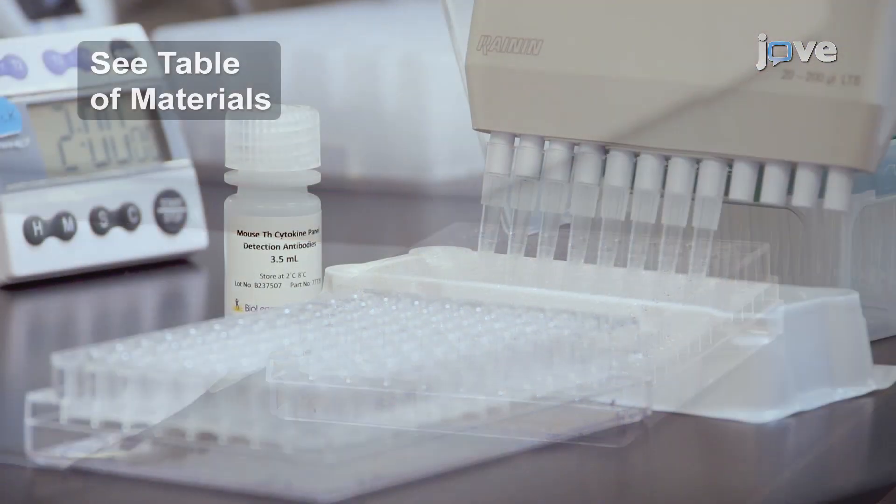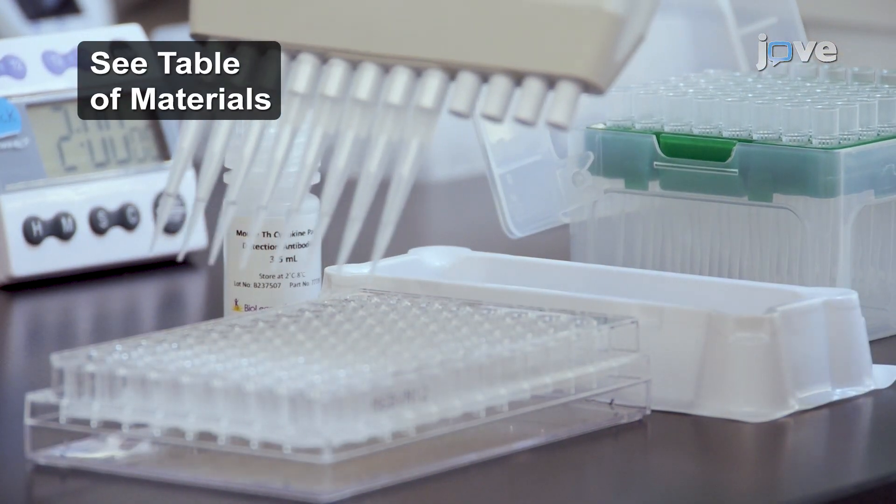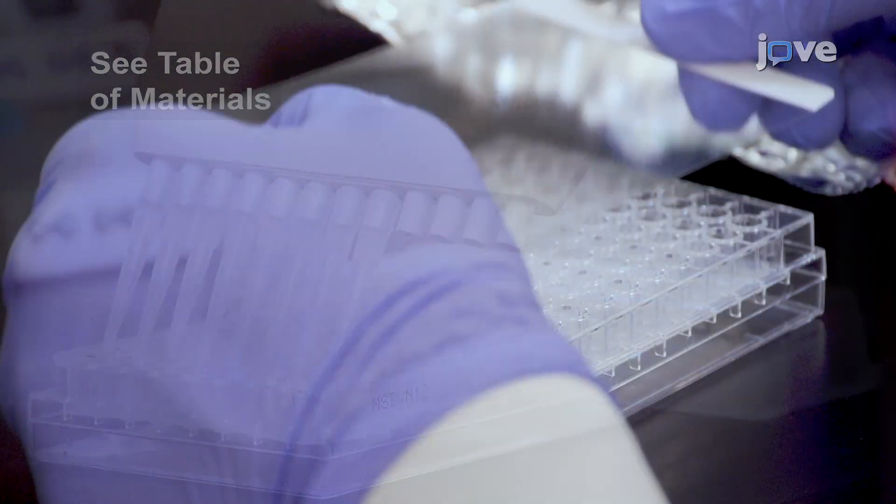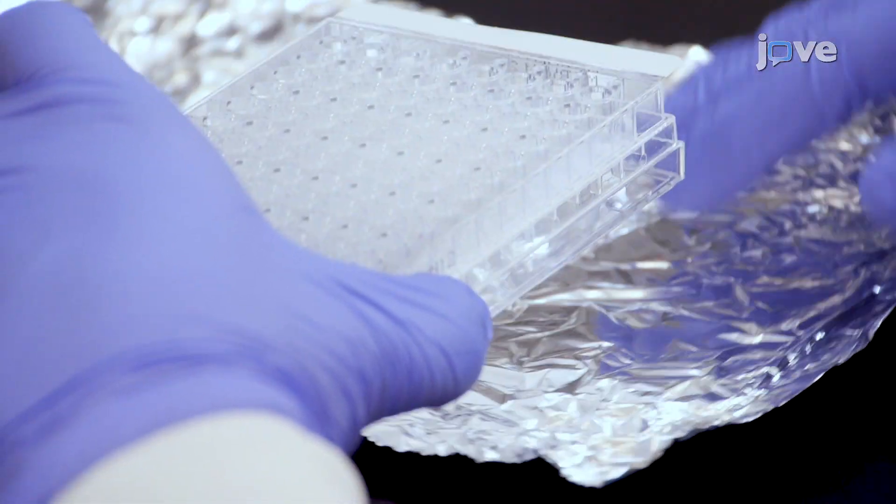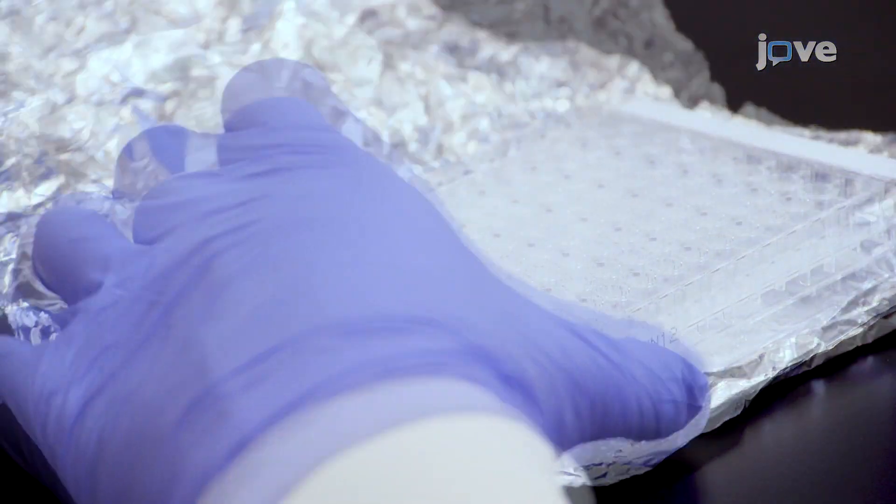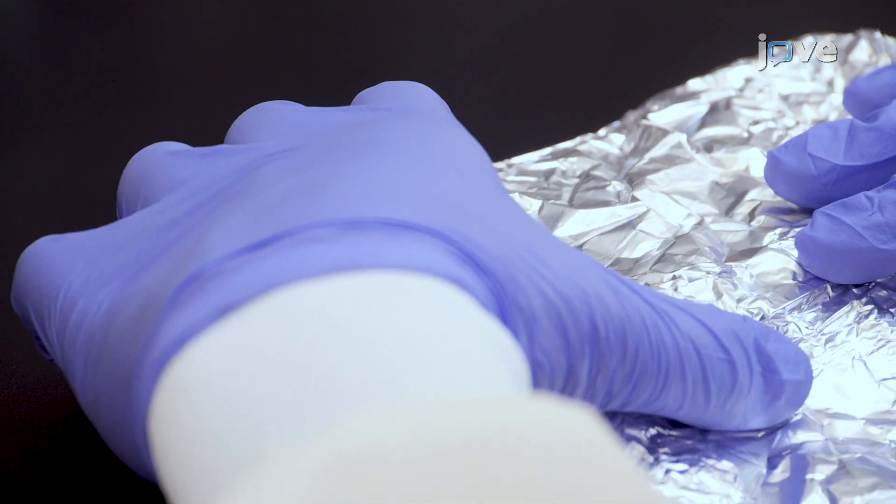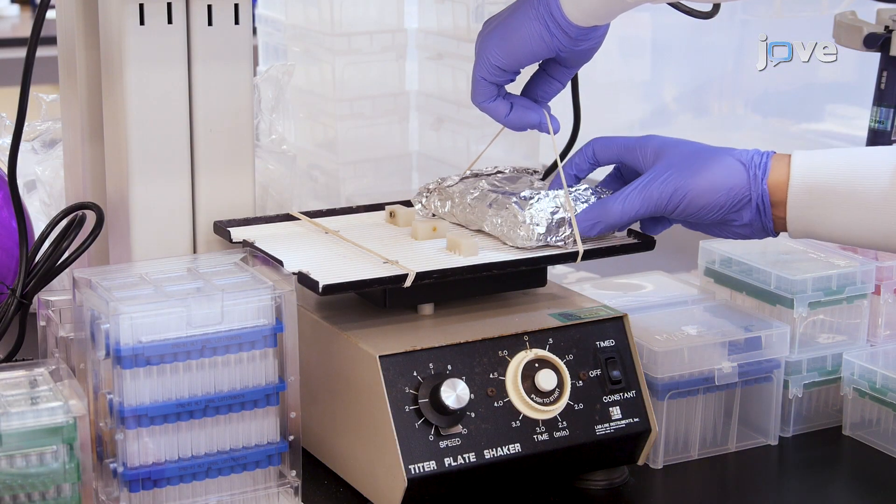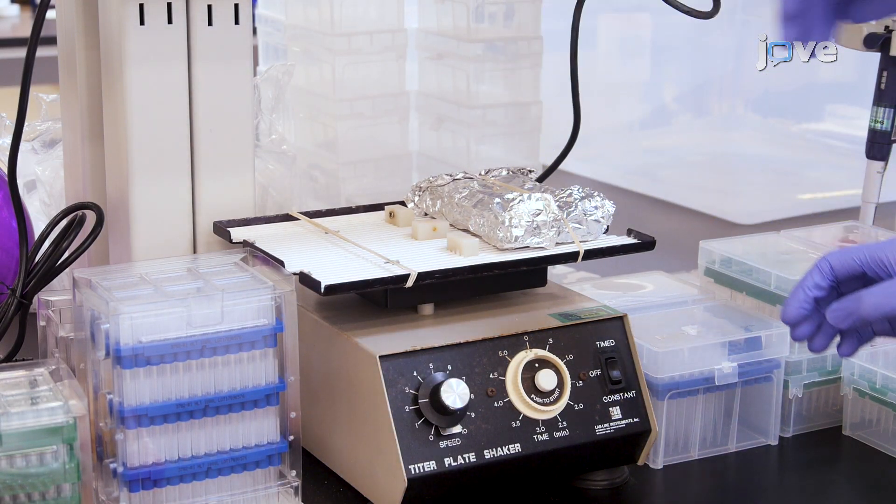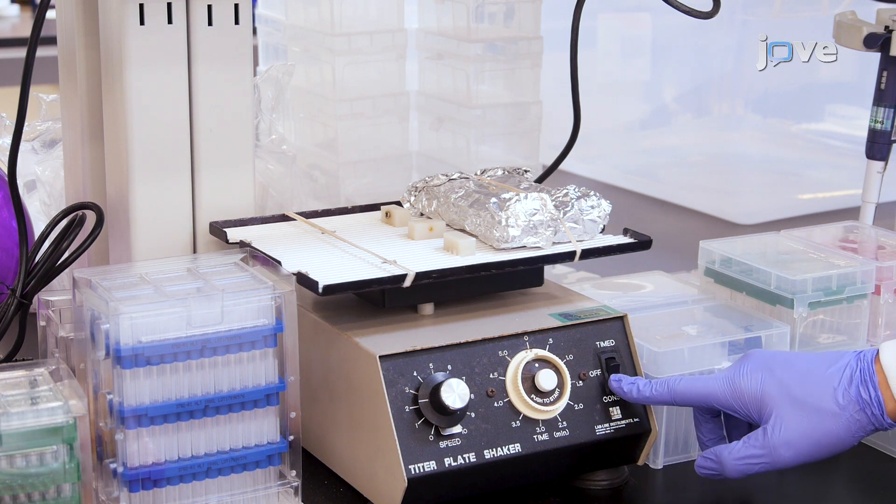Next, add 25 microliters of detection antibodies to each well. After sealing the plate with a fresh plate sealer, wrap the entire plate, including the inverted plate cover, with aluminum foil. Place the plate on a plate shaker, and shake at approximately 500 RPM for 1 hour at room temperature.